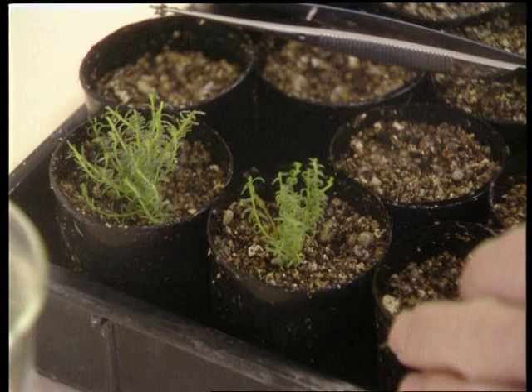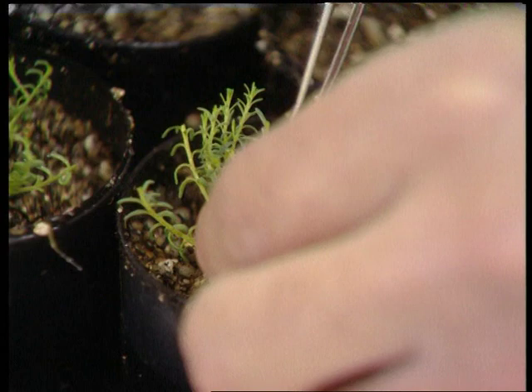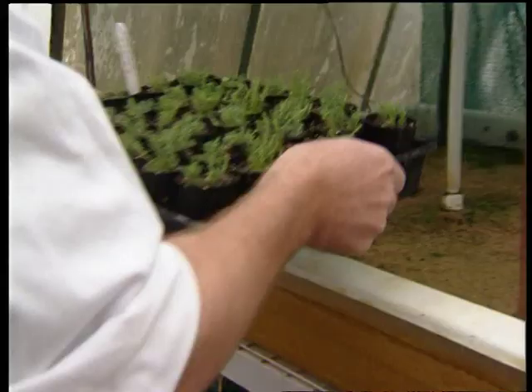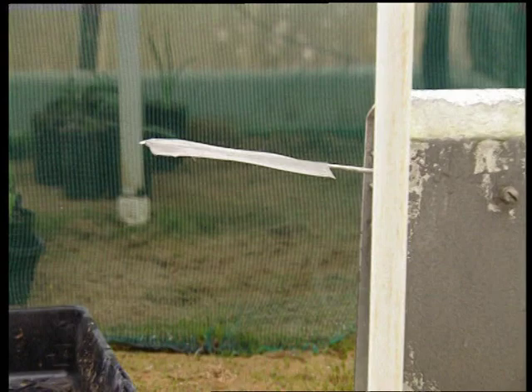No fertilizer is added to the pots at this stage. At all times, desiccation must be avoided, and that can be achieved by frequent water spray on the plants. Initially, plantlets should be protected from desiccation by placing them in a glasshouse with reduced light and high humidity. This may be achieved by use of foggers or misters or use of wet tents.